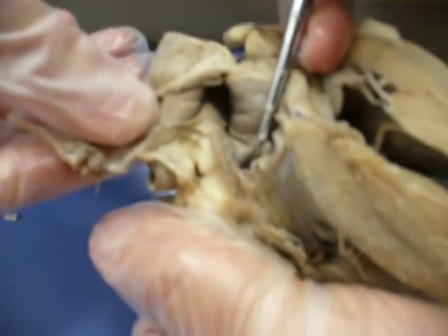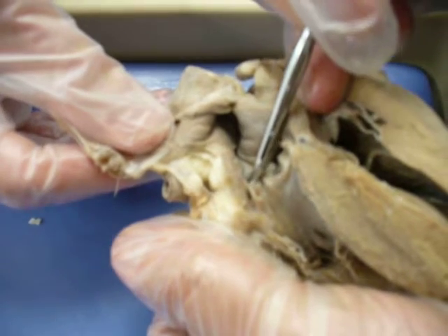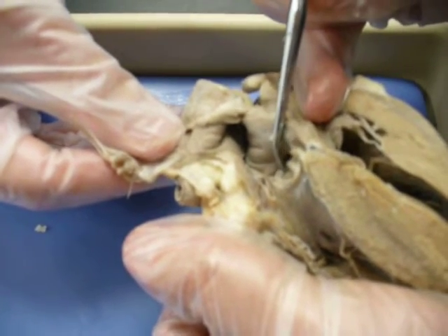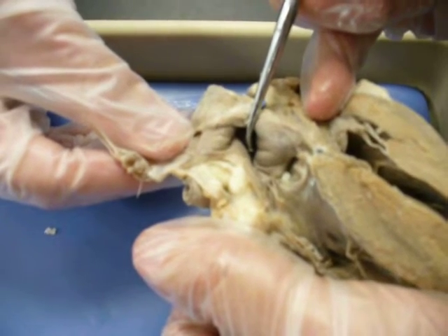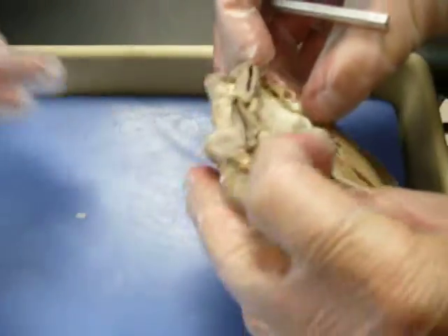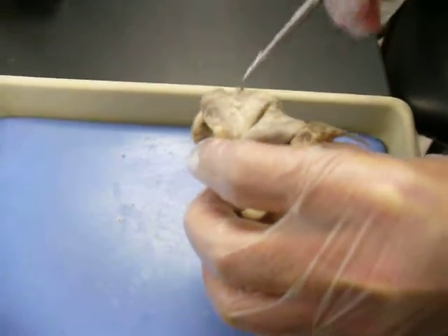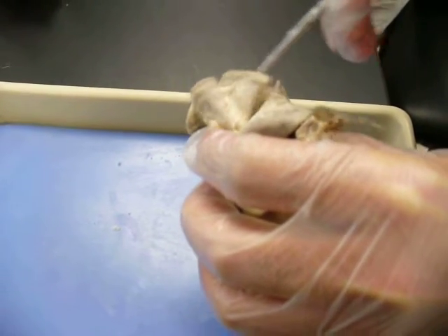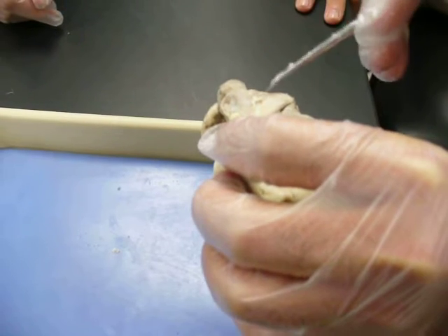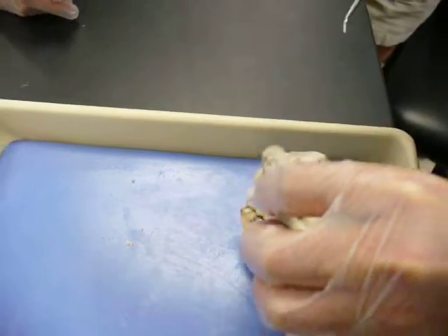That opening right there — see that dark space? That's the opening to your coronary arteries, right past your aortic semilunar valves. There's one on this side as well. Blood comes up through the aorta and out through the brachiocephalic, then through the ascending aortic arch. Then you also have the left common carotid and the left subclavian, which are not pictured and which you won't be tested over.